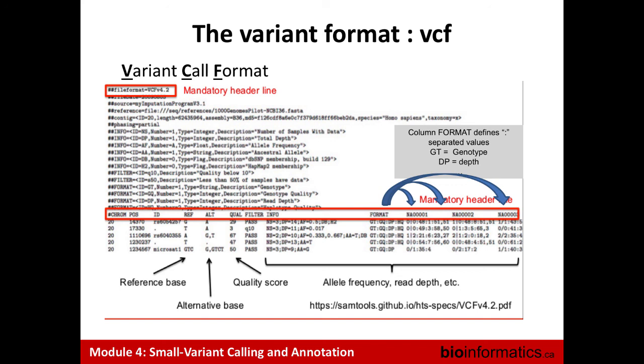After that, if you do some analysis with your variants, perhaps it will be time to think: should I include this one, which has lower coverage, in my case control analysis, because they are not at the same quality. But for variant calling, I will definitely include them.